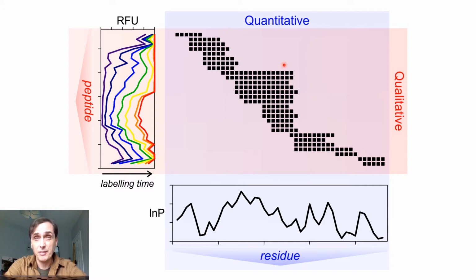When I say high resolution, what I'm actually referring to is extracting a microscopic kinetic model of HDXMS data. So really it's about obtaining more informative metrics about protein conformations.